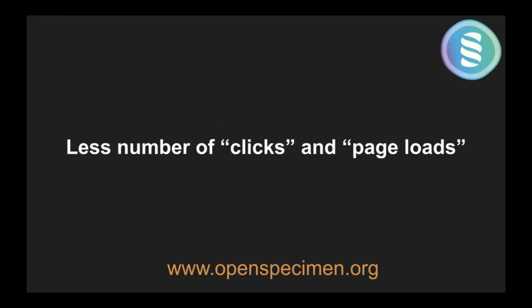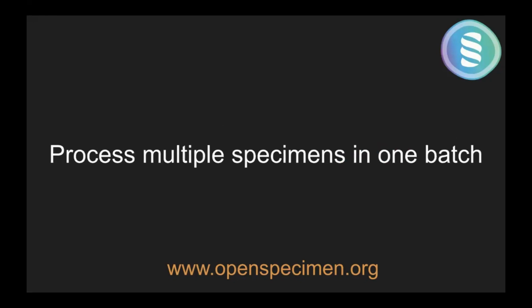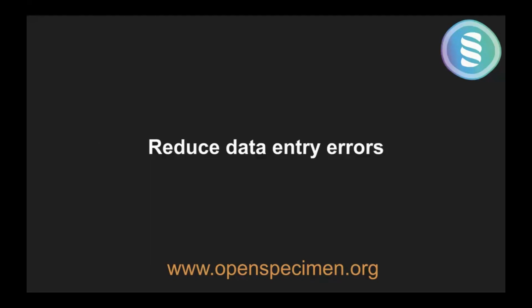Lesser number of clicks and page loads, so therefore things will be much faster. You can process multiple specimens in one batch, and also since there is a fixed set of things to do, it will reduce the data entry. Right now, once you collect the specimen, you might have to go back and do some other thing on the specimen. Whereas with the guided tour kind of thing, there is less chance of someone missing something and committing errors.